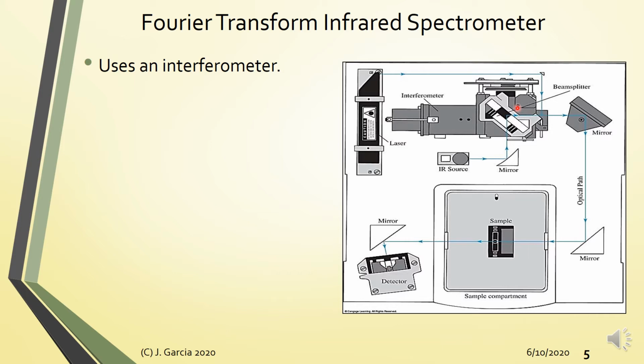Okay, so ang advantage nito, i-run down natin. So ang advantages nito against dun sa sinauna, wala na actually yun, yung dispersive IR, is that of course it has better sensitivity thanks in part to its detector. Okay, the detector used for FTIR is hindi na siya based doon sa thermocouple, thermistor, or bolometer.